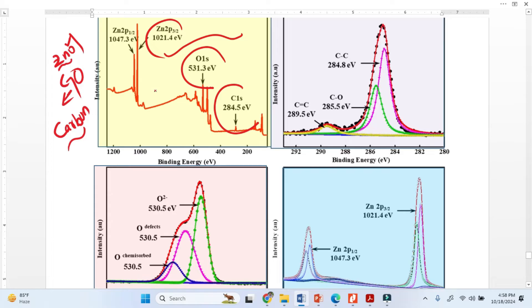These peaks we call convoluted peaks. Convoluted means we cannot exactly see the detailed analysis. So we have to deconvolute these peaks, and for that purpose we take the high-resolution spectra. This is the carbon peak — we deconvolute it.